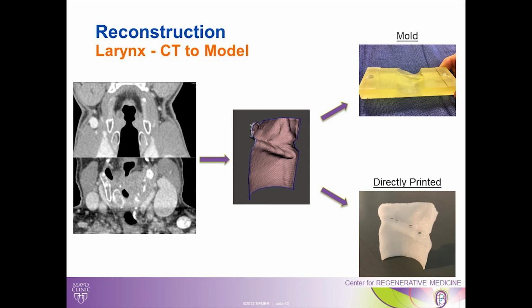A lot of that has to do with the complexity of the 3D structure. It's a lot harder when tissues are really complex. They have a lot of complex structure like ear to print those directly. Maybe a lot easier just to print a mold and shape another scaffold like hyaluronic acid or something else, like maybe even a biogel that you can form into that shape. So different considerations, again, based off different biomaterials.